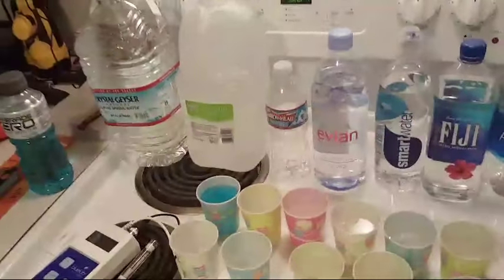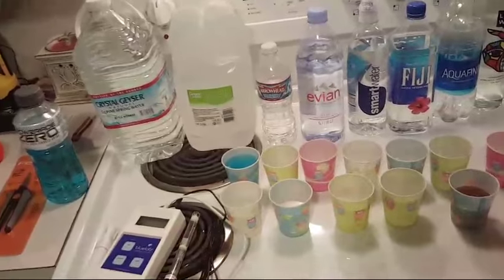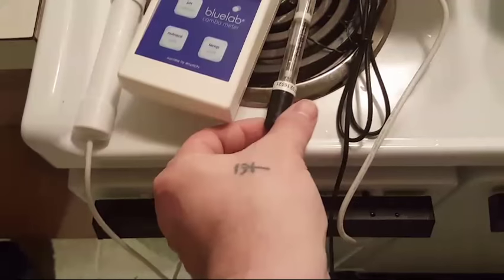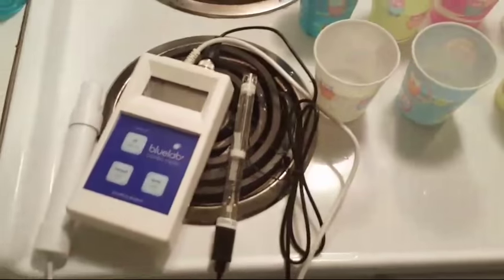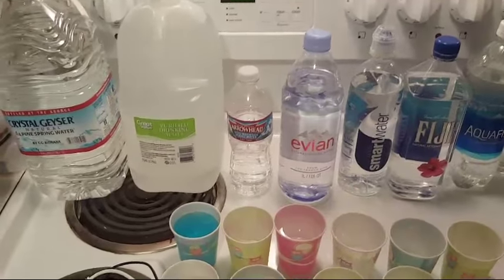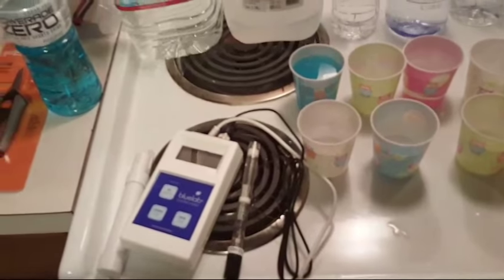Hey, we're going to do a quick scientific test of the pH of different waters, and also the TDS. What's different about this and most other videos is most videos don't use an expensive scientific measurement tool. This is the pH pen and combo meter — basically the computer — and this is the TDS meter, which also takes temperature. Most people use cheap strips or pool drops that don't truly tell you the pH.